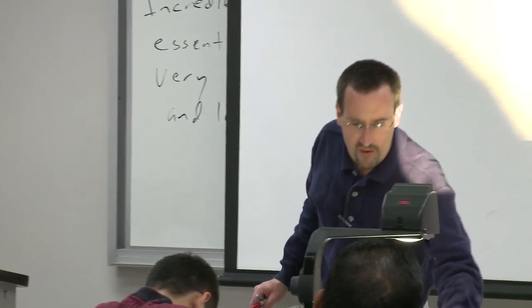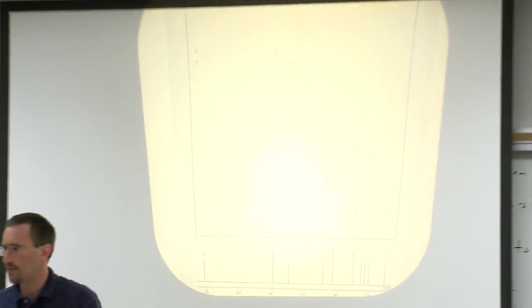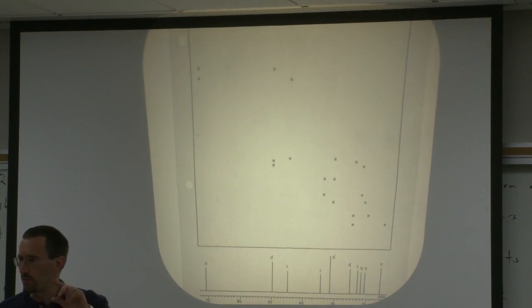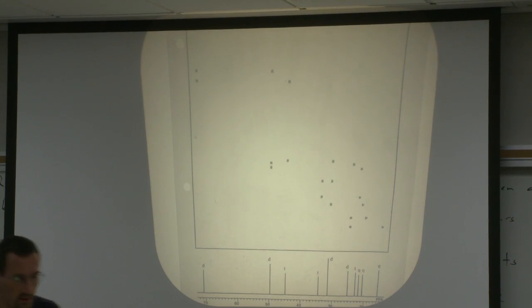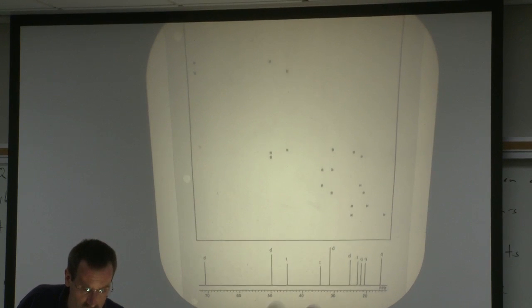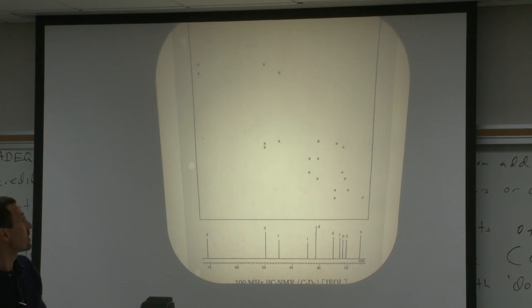A lot of the examples and handouts I've been giving you are from a book by Koji Nakanishi, who's a natural products chemist. Basically, he put together various nice little 2-page handouts in the book on various spectroscopic, various NMR techniques. They were recorded on a 400 megahertz machine. So this is recorded on a 100 megahertz carbon NMR spectrometer. So nothing, and they're kind of old, so it's nothing near as powerful as what you have downstairs with the cryoprobe.